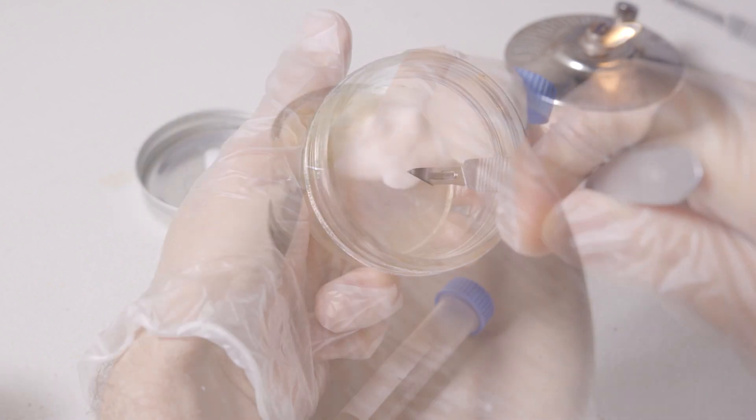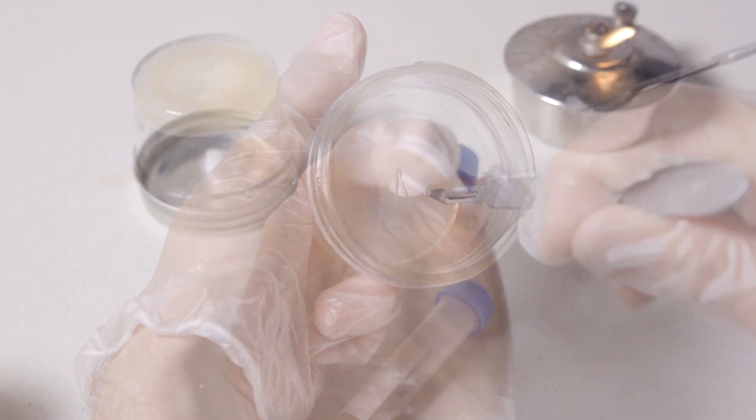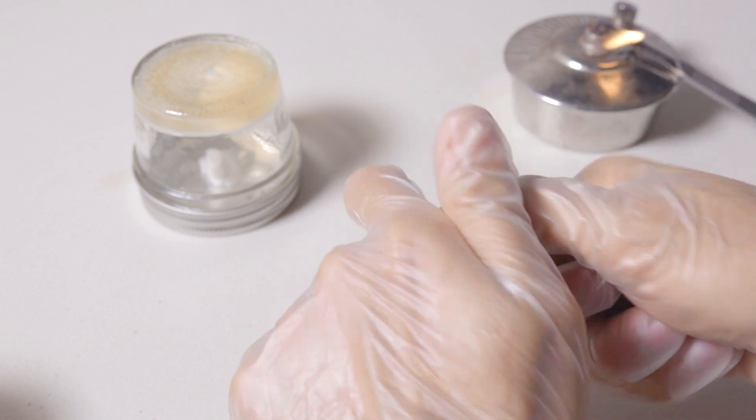Now that we've finished putting all of our cultures into slants, the last thing I like to do is take a piece of parafilm and then wrap up our tubes so that way they can stay airtight during storage.